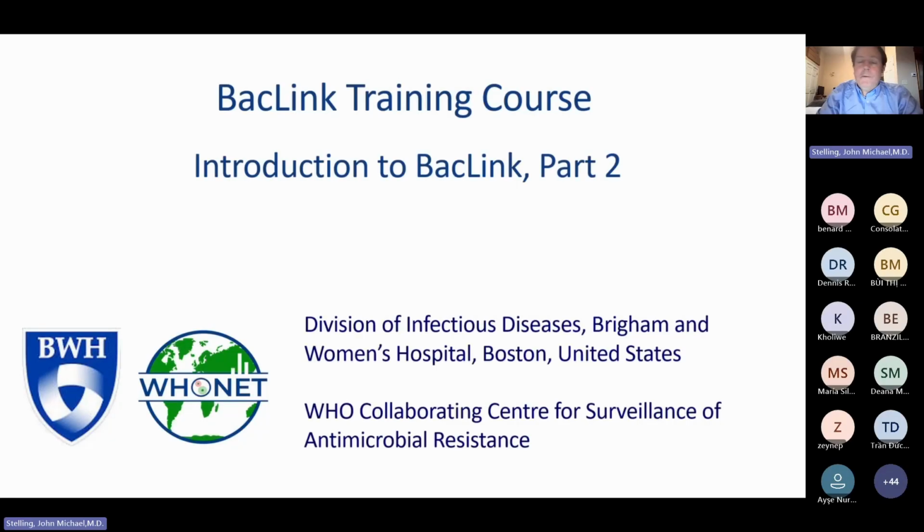This will be part 2 of our BacLink webinars. We did part 1 at the beginning of October. That webinar is available on the WHONET website. I will show you where that is. And before the end of this week, part 2 will also be up on the WHONET website.